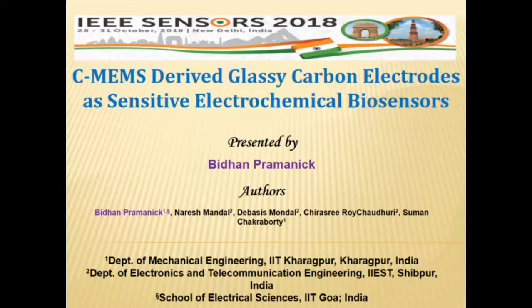So I'll be presenting on our work on behalf of my team. The work is on carbon MEMS. That CMEMS stands for carbon MEMS derived glassy carbon electrodes as sensitive electrochemical biosensors. In this work, I'll mainly focus on the fabrication techniques of these carbon electrodes as well as its application in the bioelectrical format.